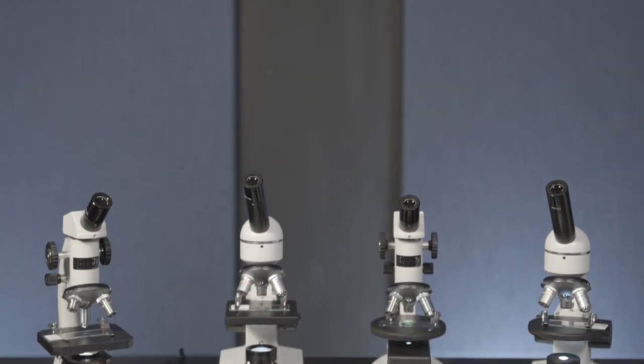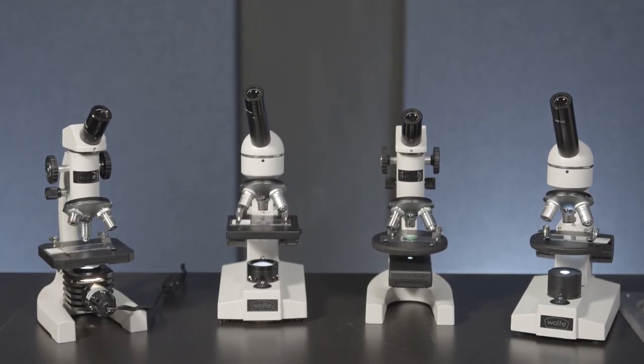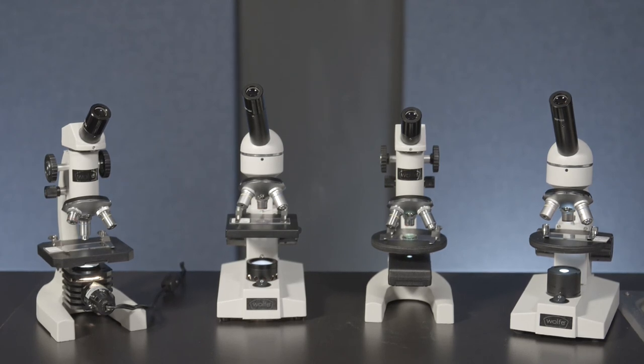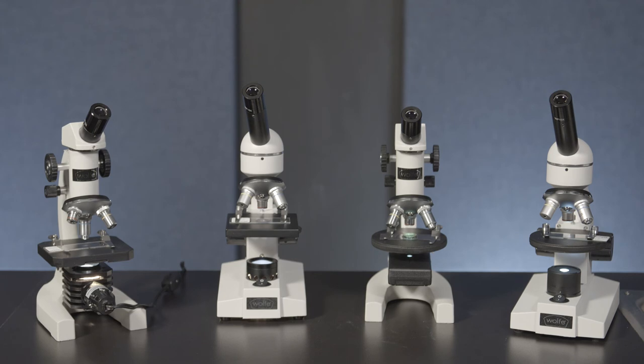Carolina offers a full line of microscopes suitable for all grade levels. Each microscope in our catalog and on our website is labeled with the appropriate grade levels to make your selection easier.